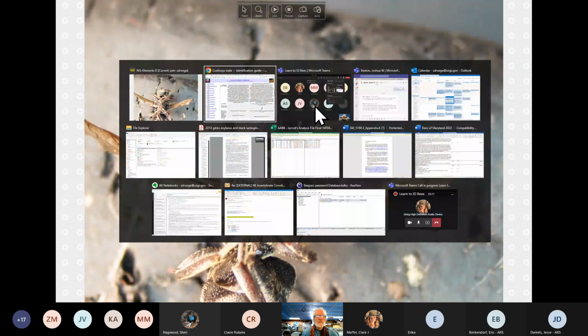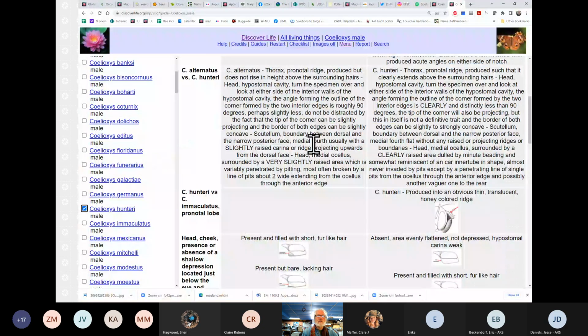Now, when we go to the scutellum, we're looking at where the rear of the scutellum turns over and presents a posterior face versus the dorsal face. And the posterior face is narrow, and that's where these appressed hairs often lie. I can't recall in this particular species what that pattern is. We'll take a look, unless they're messed up.